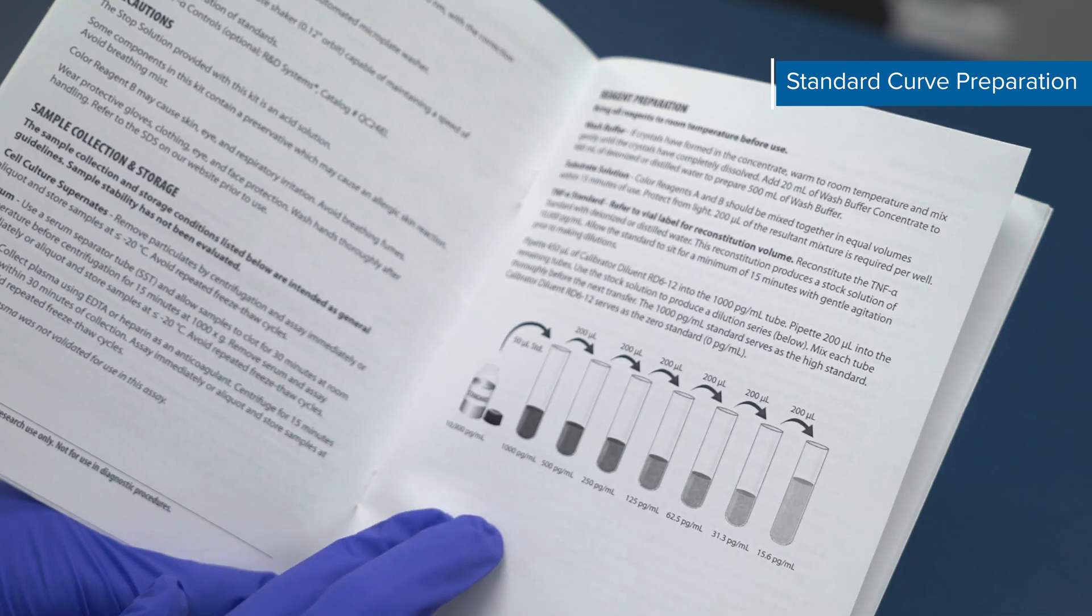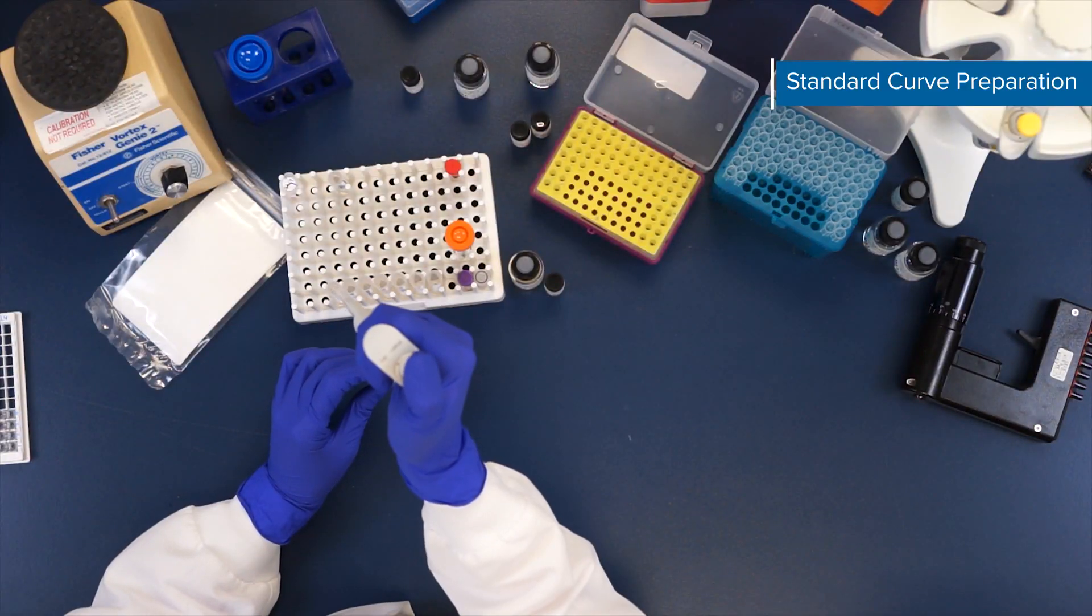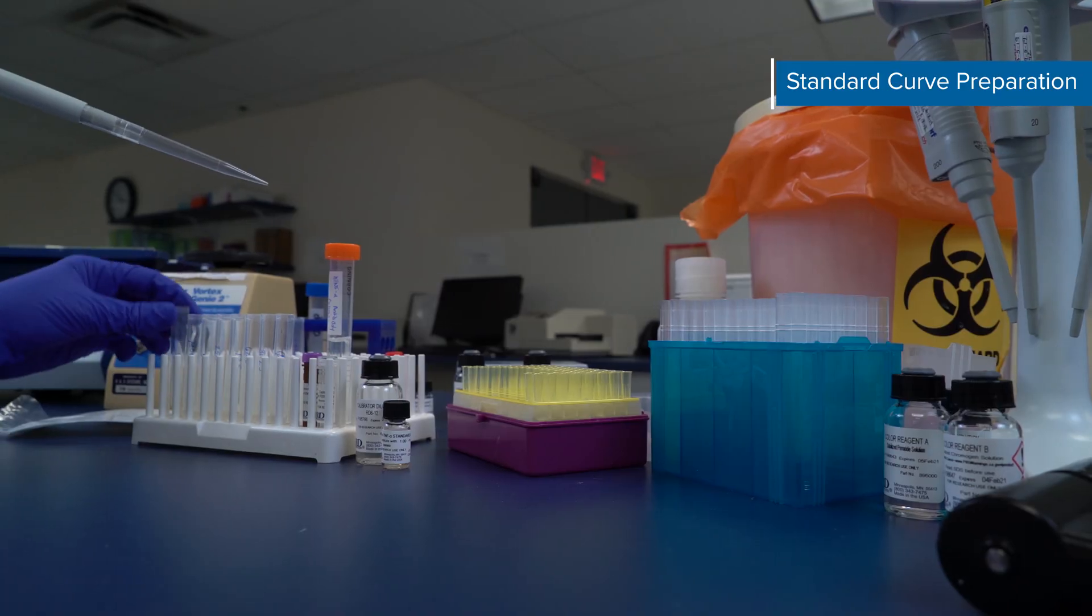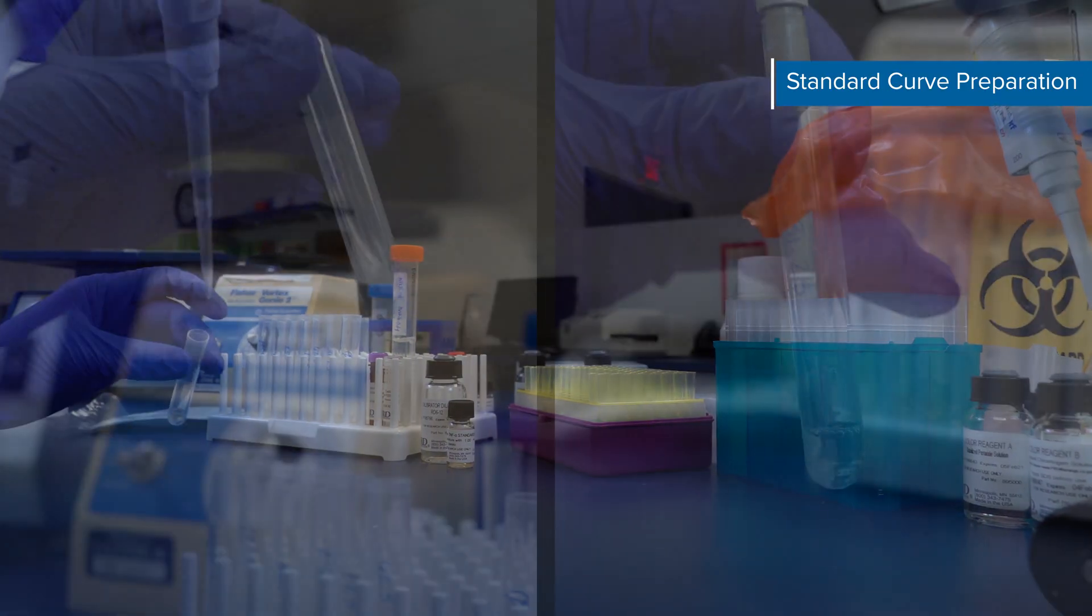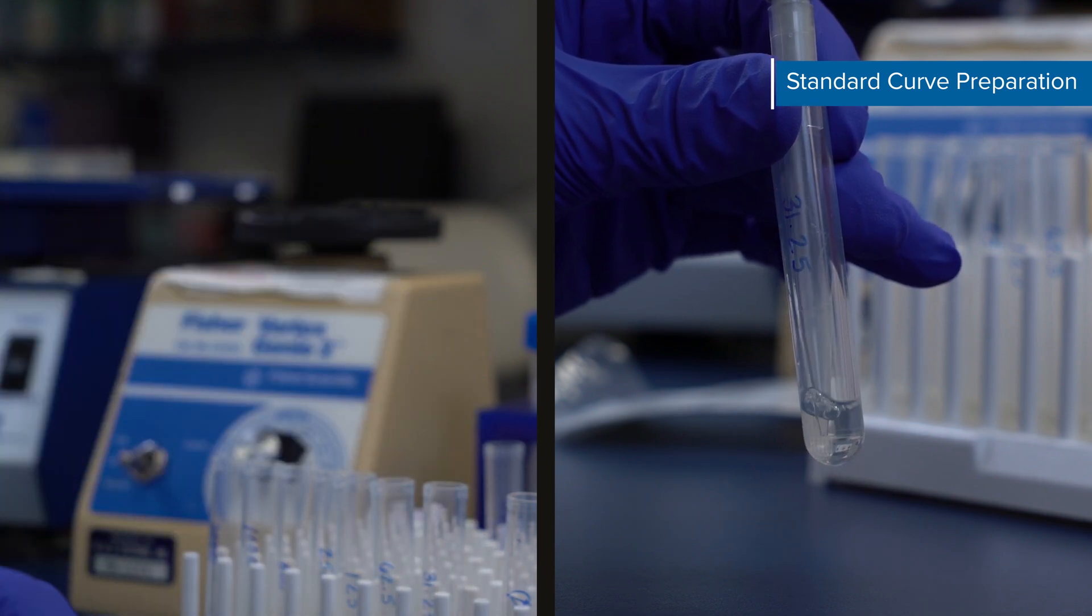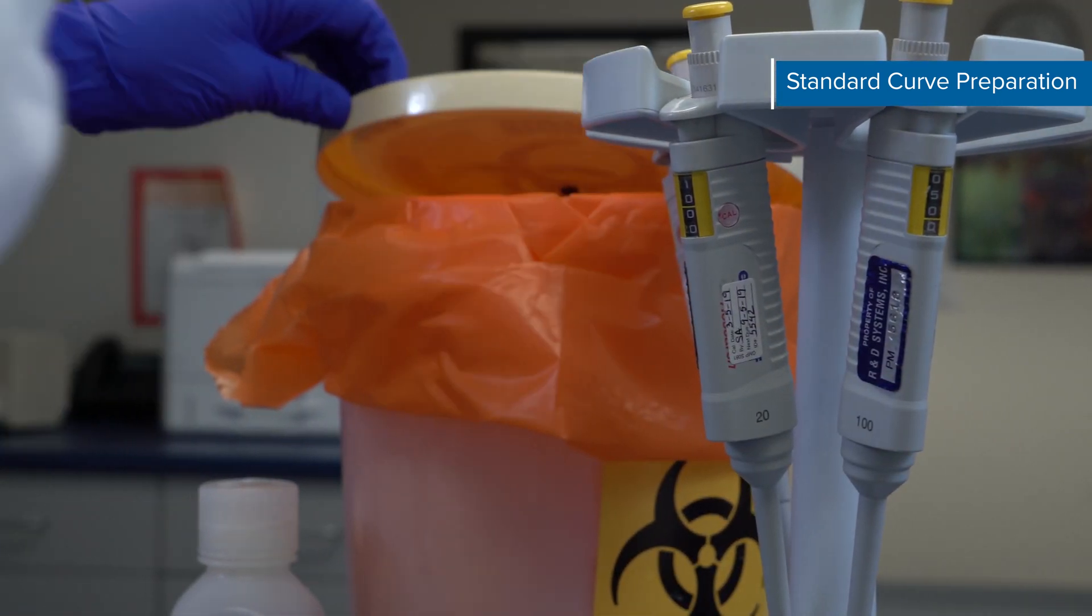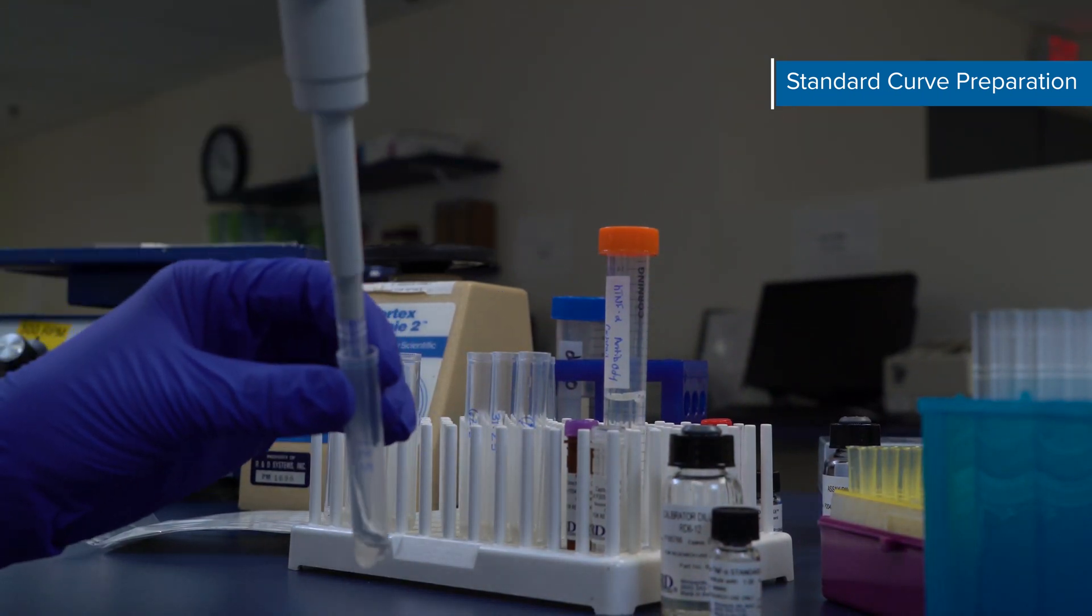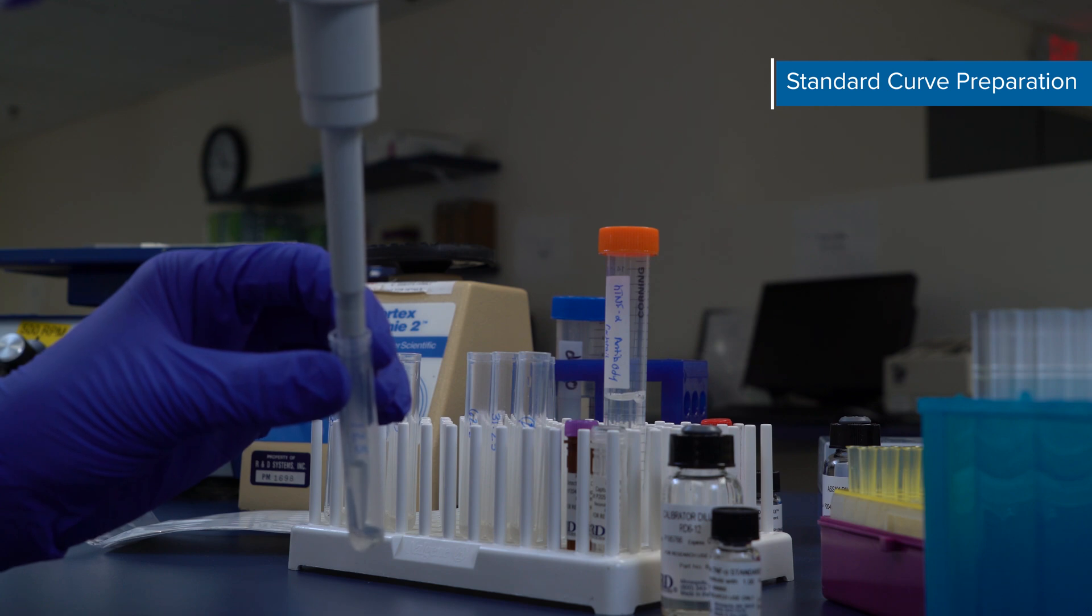Check your kit booklet to ensure you have the right volume and diluent. Next, pipette 200 µL of the appropriate calibrator diluent into the remaining tubes. Use the high standard to produce a 7 point standard curve. Be sure to mix each tube thoroughly by very briefly vortexing. If you don't have a vortexer, you can lightly tap the side of the vial or pipette up and down. Try to minimize foaming and bubbles. Change pipette tips before transferring to the next tube.